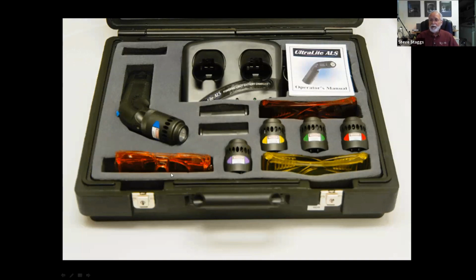Now, what you're also going to need is a cutoff or barrier filter for your eyesight, because if you put on the blue filter, all you see is blue light. You're not going to really see what the blue light does. In order to see what the blue light does, you have to cut the blue light out of your vision. To get the blue light out of your vision, you use orange or sometimes amber goggles.